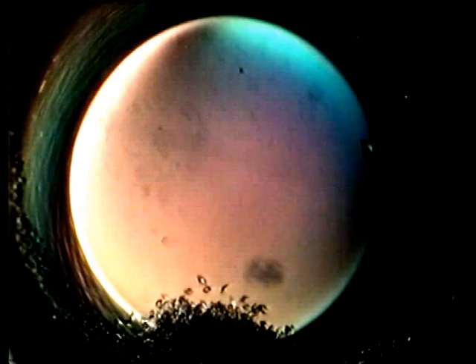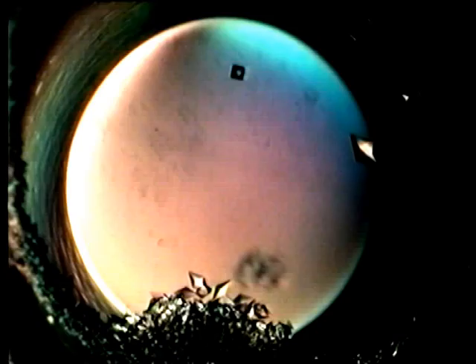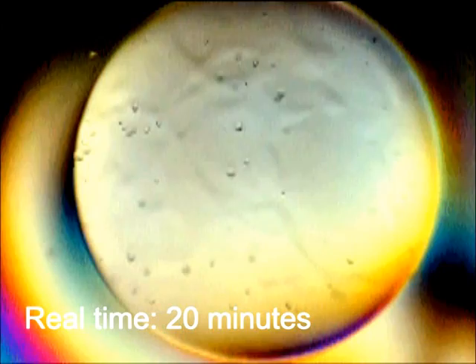Each molecule studied is unique and it is impossible to predict in advance the conditions necessary for its crystallization. Determining the right conditions involves screening many test solutions of very different compositions.